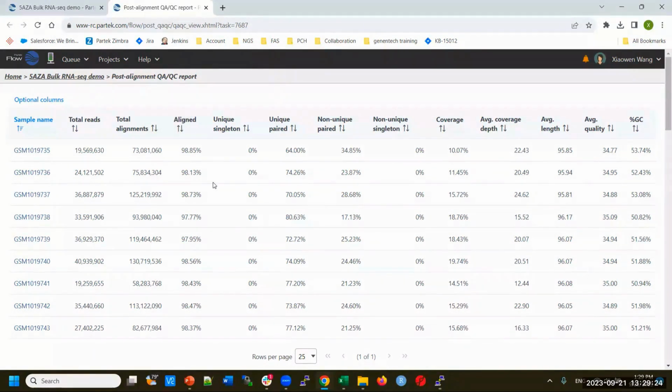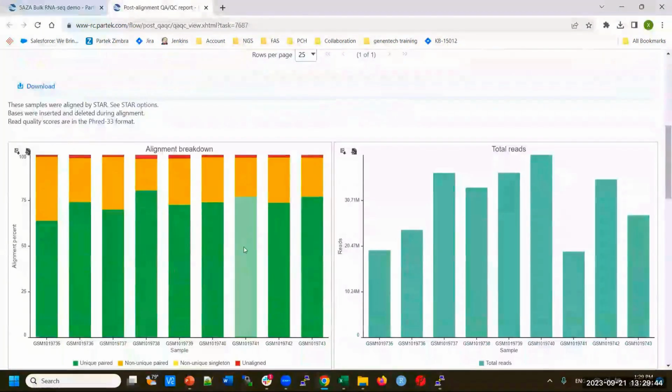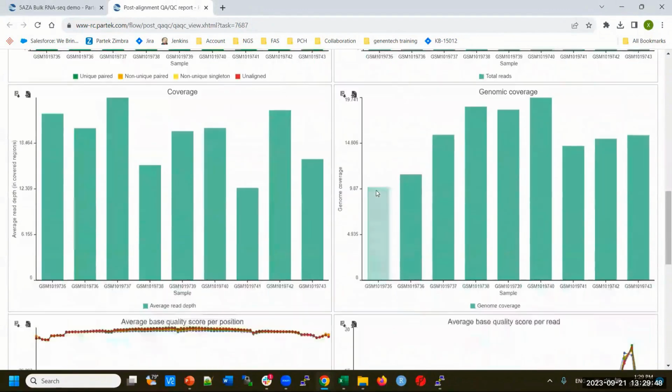Maybe when you extract the RNA, you extract some other species. Your data got contaminated with other species. There's really not a whole lot that you can do. You just waste your time to sequence some species you don't care about. Right? But whatever the aligned, you can still do the downstream analysis. Okay. And then those are the graphs showing the breakdown, basically to reflect the table.